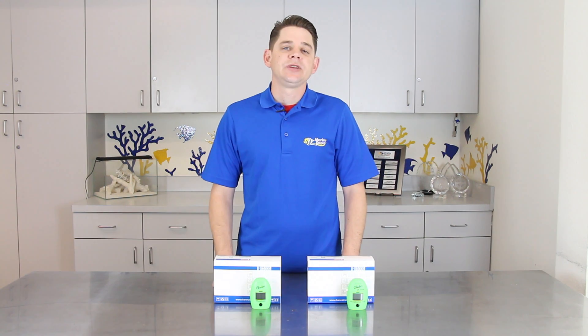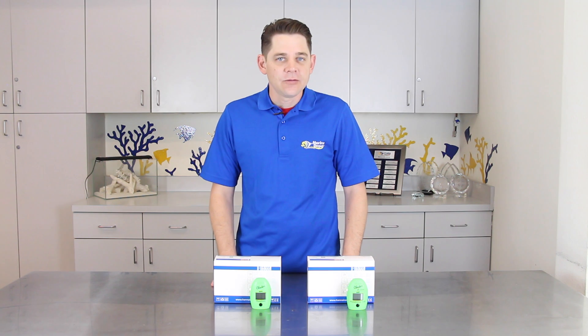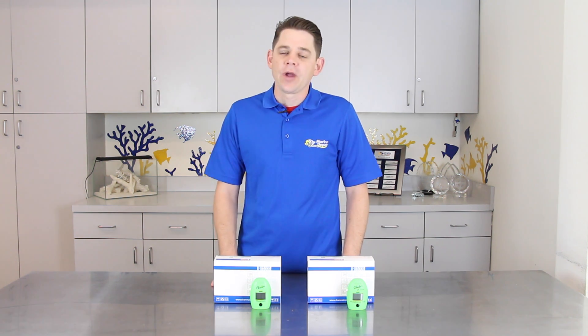If you're having algae problems and need to get your phosphate under control, or want to take your reef-keeping skills to the next level with ultra-precise testing, the Hanna Instruments phosphate checkers are a great option.